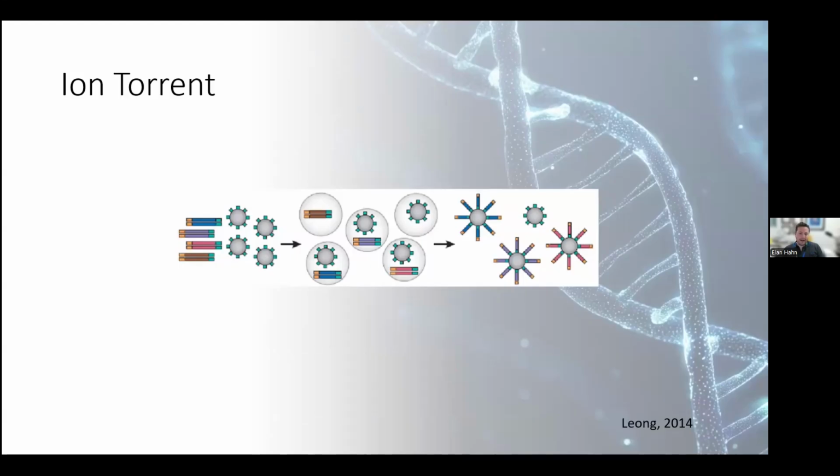And what happens is we're going to separate these droplets of individual PCR reactions into microreactors. Having PCR at this stage can introduce sequence errors or preferentially amplify certain areas, which may skew our fragment representation. So basically what you end up with after this PCR is beads coated in three dimensions with amplified identical product.